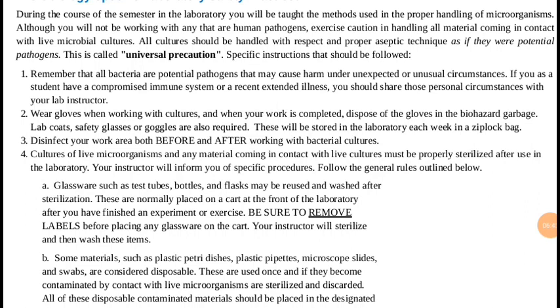You should disinfect your work area both before and after working with bacterial cultures. Now in some lab sessions you could be using live microorganisms, and all those live cultures and the materials that we use to handle live cultures must be properly sterilized after use in the laboratory.